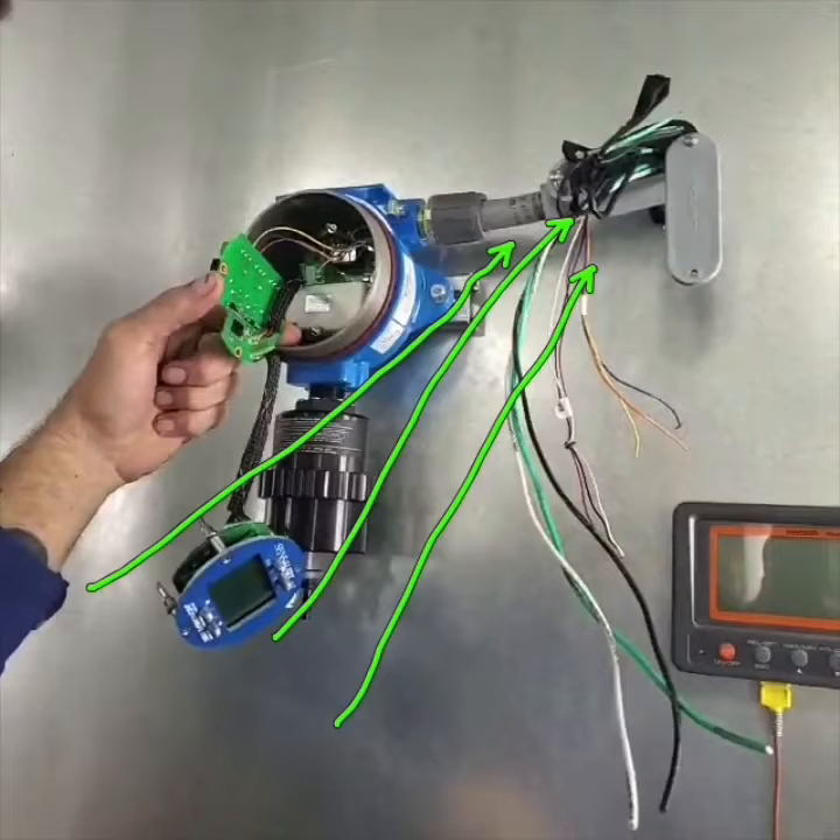To put that into perspective — a house, the biggest air conditioner you can have for a house, provides 2,000 CFM. So this fan basically moves the same amount of air as nine household air conditioners. It moves a lot of air, and we'll get into that in just a bit.